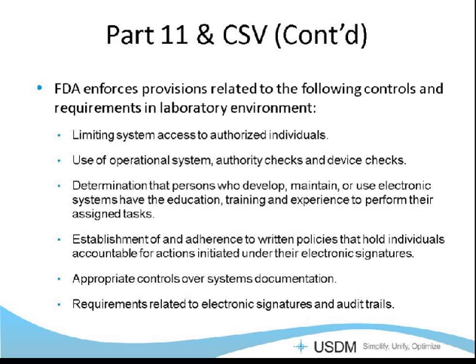their handwritten signature. And then obviously the FDA enforces requirements related to electronic signatures and audit trails. And many laboratories have systems that do not have audit trail capability nor electronic signature capability, but the audit trail is critical. So we need to have procedures in place and be looking at whether or not we can replace this legacy equipment now with something that has a more current Part 11 compliant capability.